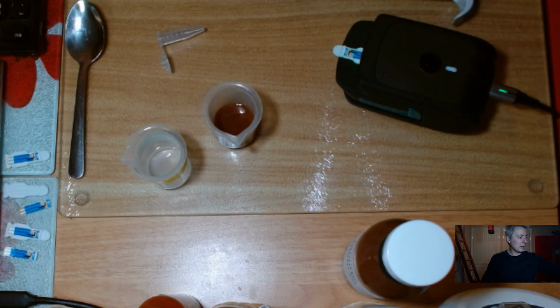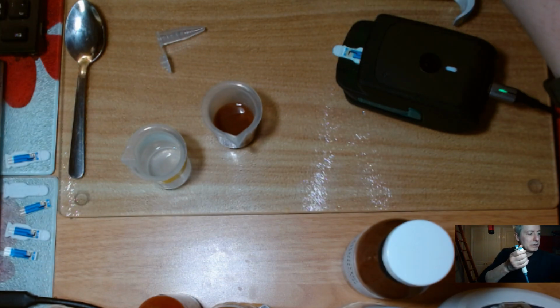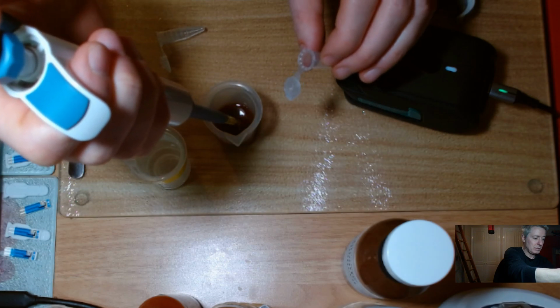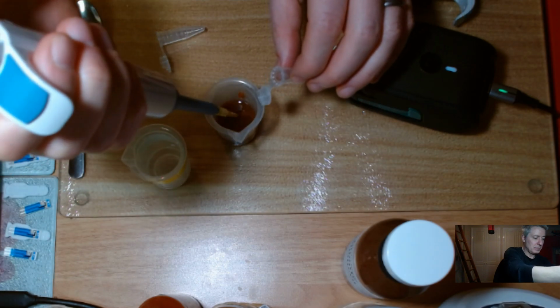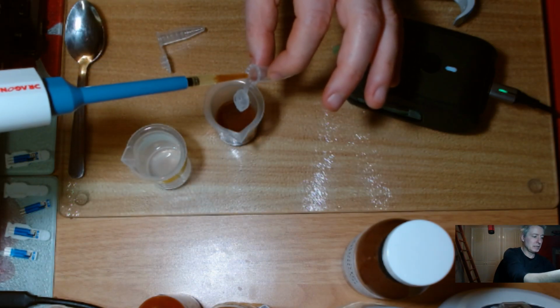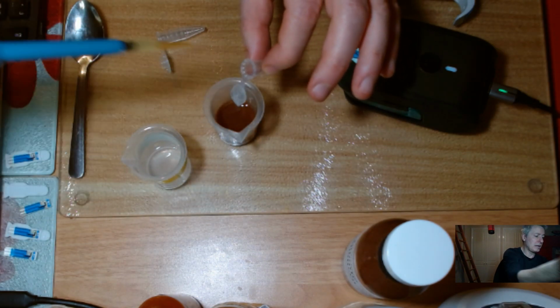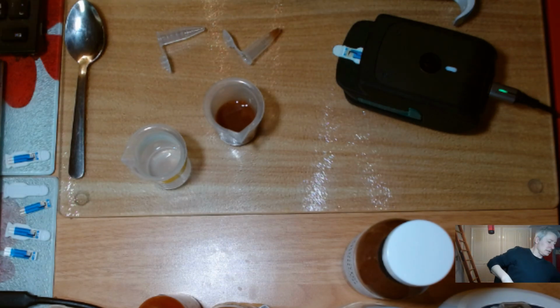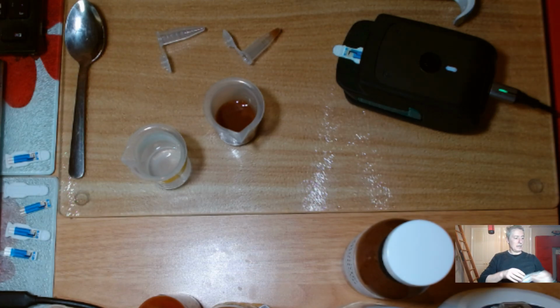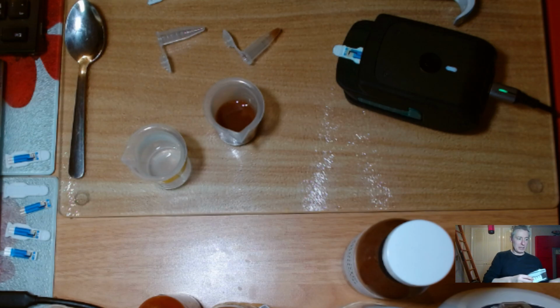So I'm going to take 100 microliters of this, which I will put into a little vial here. I might just do that again. Right, so I've got 100 microliters like that. I'll put it into that vial. I realise I put in a clean sensor, so I'll just grab a clean sensor as well, which I will put on. So I've grabbed a few sensors, and I will use those shortly.